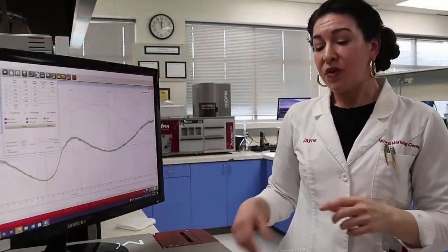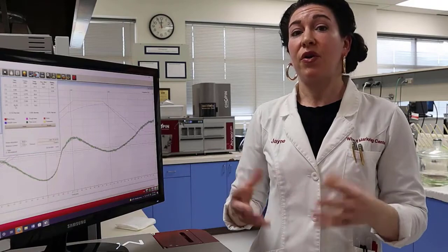How different is it to analyze starch compared to using other instruments like the RVA or amylograph? So the main difference between the MixoLab heating portion and some of the other instruments that are on the market is that these other instruments typically will heat the flour or a starch sample with excess water. So you're creating a slurry or basically a batter where there's more than enough water to fully gelatinize the starch.